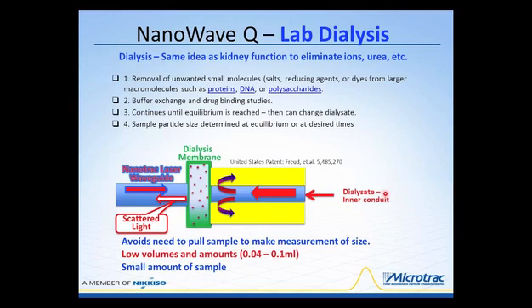So the dialysate, under a pumping system, is passed down through basically kind of like a coax cable or something. It is passed down through the center of this conduit, and here the dialysate interacts with the dialysis bag itself. But then it continues on its way and passes back out of the system.